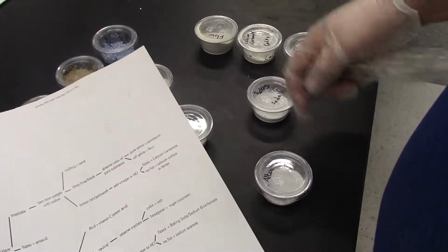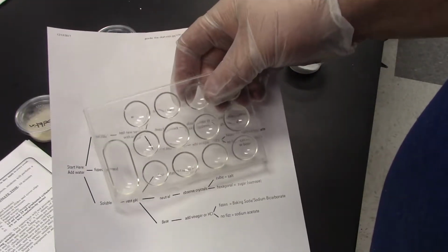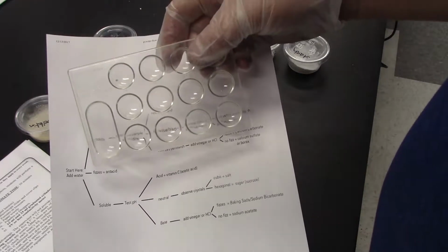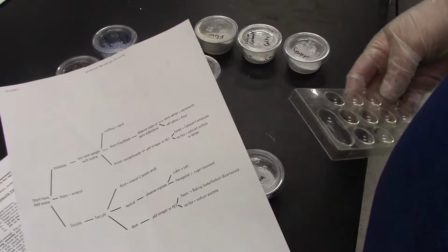However, if this was baking soda and I put it into water, you're going to see it dissolve. So we know it's not insoluble. And it didn't fizz when water was added to it. The next thing we do is test the pH.